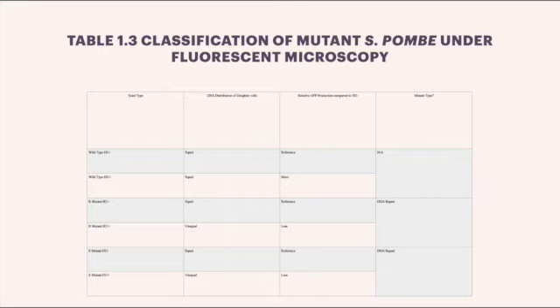For the wild type, in regards to the DNA distribution of daughter cells, they both will be equal. And for the relative GFP production compared to the HU minus, in the wild type, the HU minus is of course the reference, while the wild type HU plus will show more RAD22 GFP production. For the mutant type, the wild type is not a mutant, so it is NA.